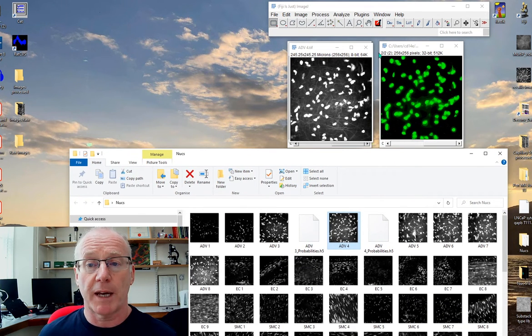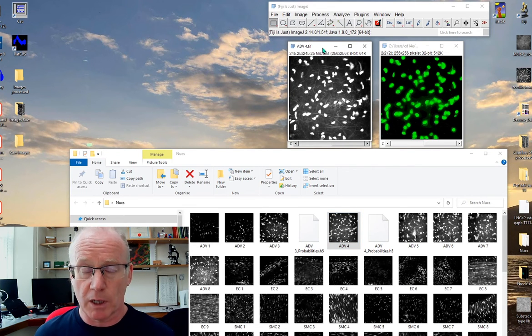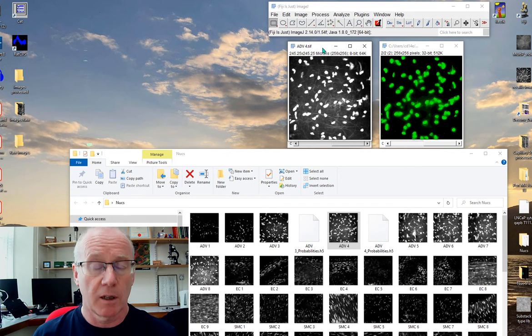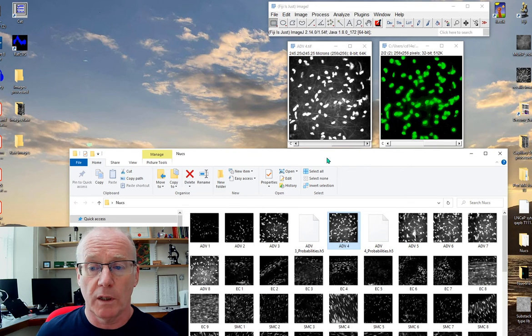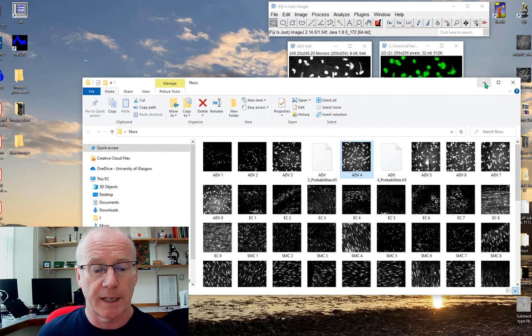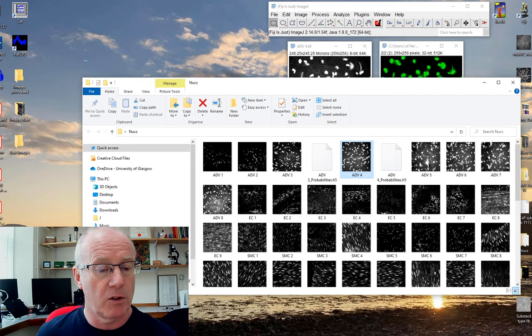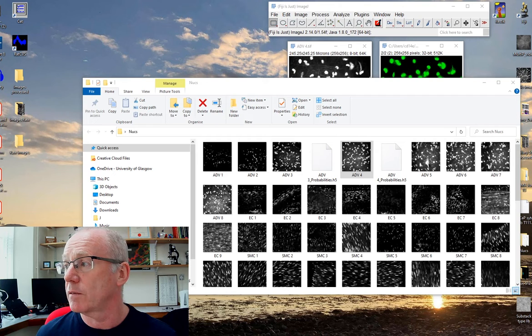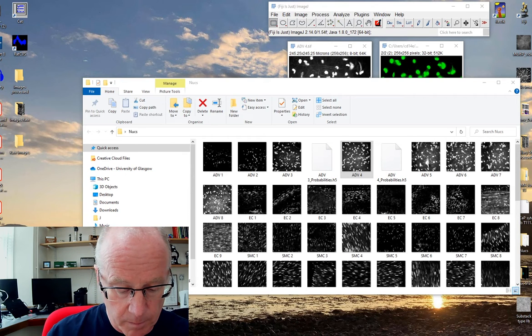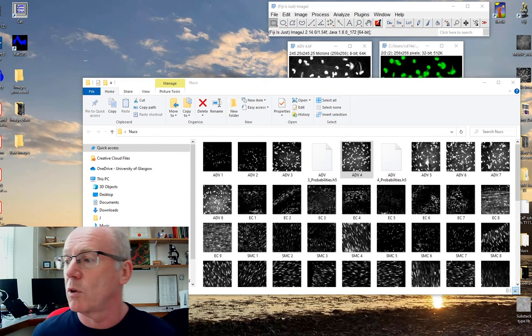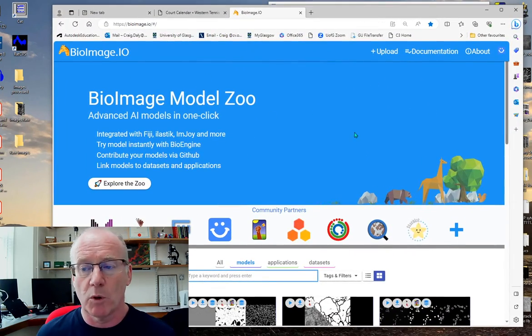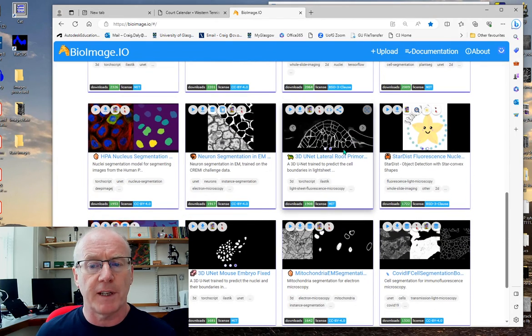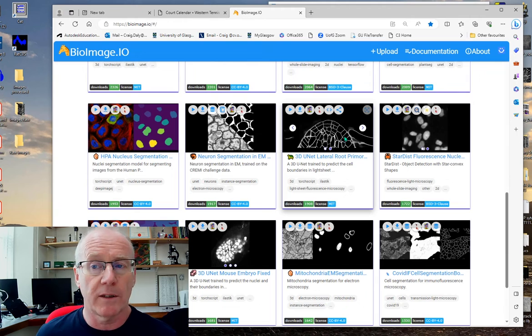Bear in mind that that was a very, very rudimentary training network and the more time you spend training the network then the better Ilastik will be. One last thing to say about Ilastik before signing off is that I would recommend you go to the bioimage zoo at bioimage.io. Here in the bioimage model zoo are around about 50 different trained networks that you can load into Ilastik.